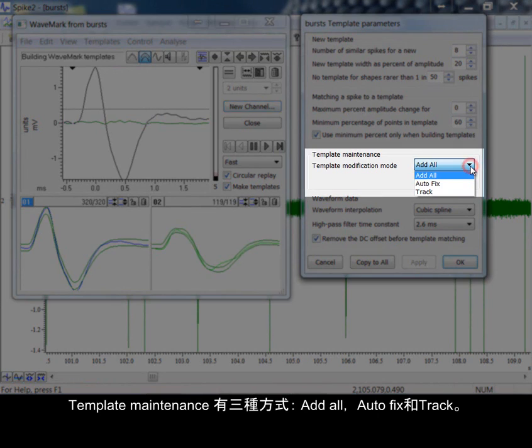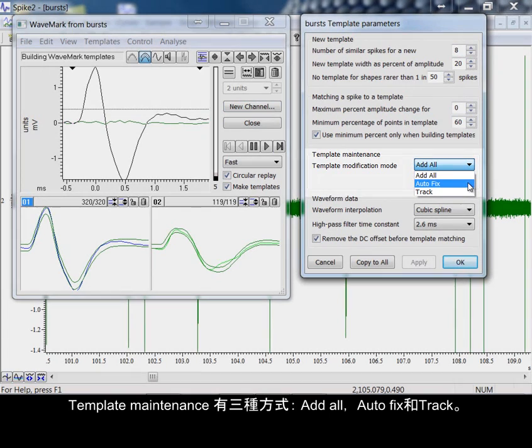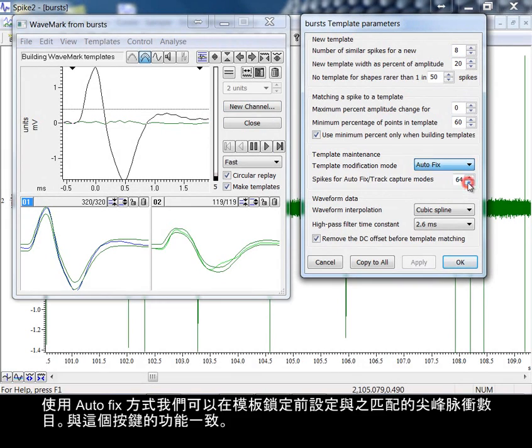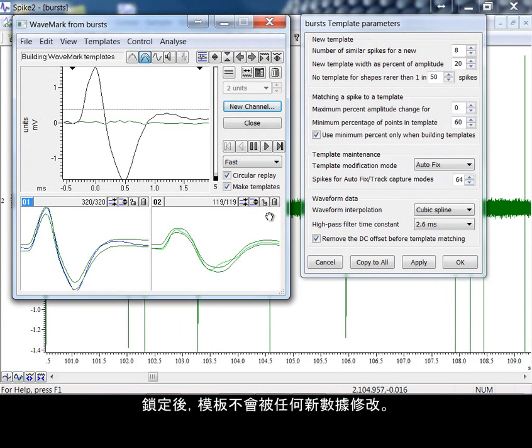Template maintenance has three modes: add all, autofix, and track. With autofix, we can set the number of spikes that match the template before it is locked, equivalent to pressing the button here. Once locked, the template will not be modified by any new incoming data.